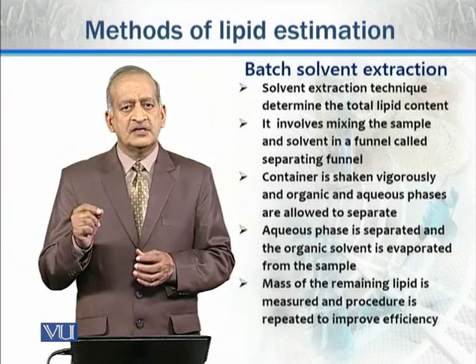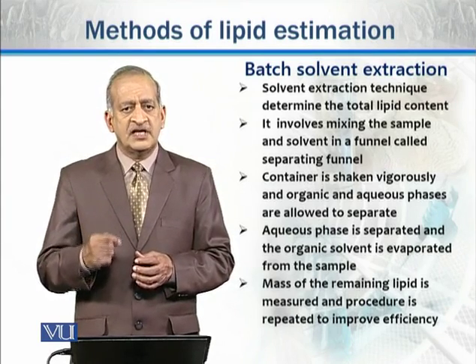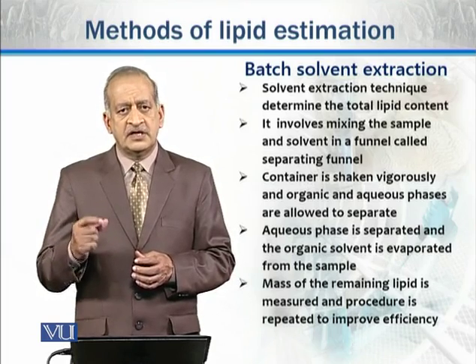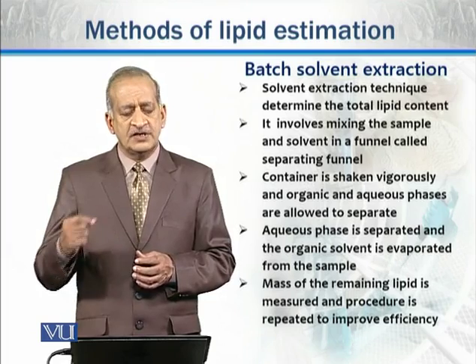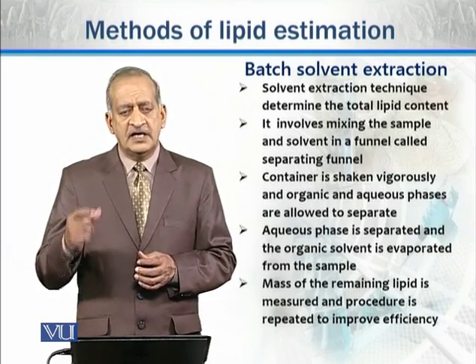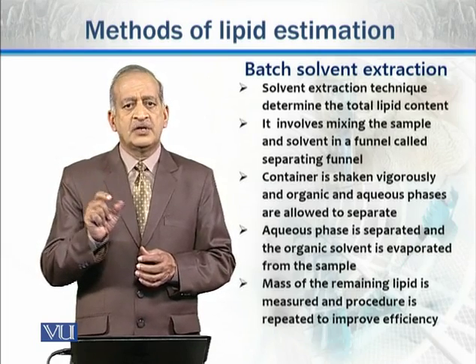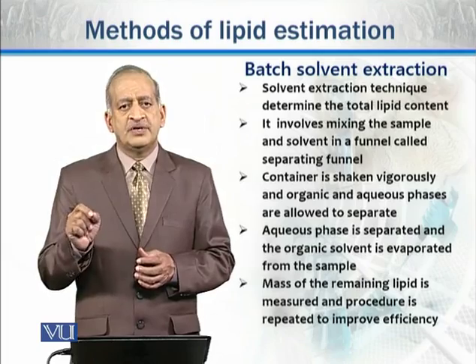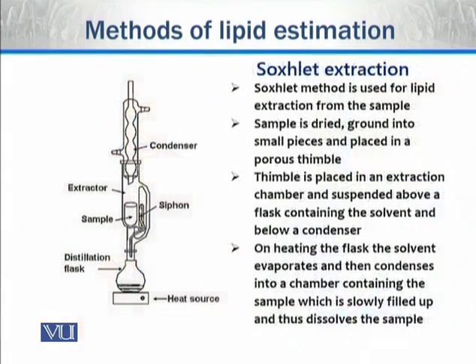When this organic phase is evaporated, what is left then? The lipid that is left. This lipid is measured. It is quantified with the help of some suitable balance, and its percentage is calculated. That okay, this sample contains this much lipid, and then we can convert it into its percentage.